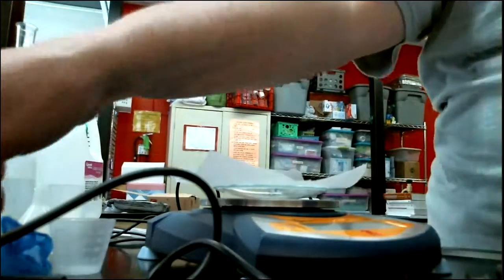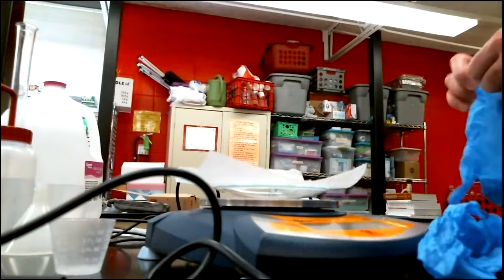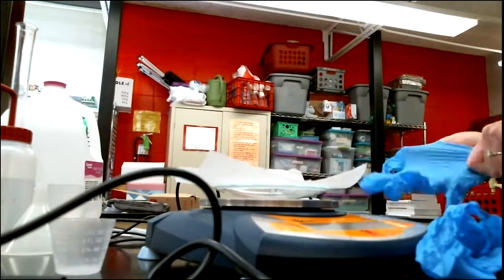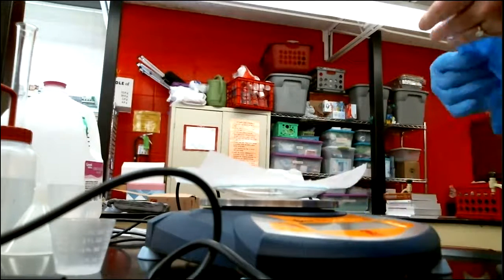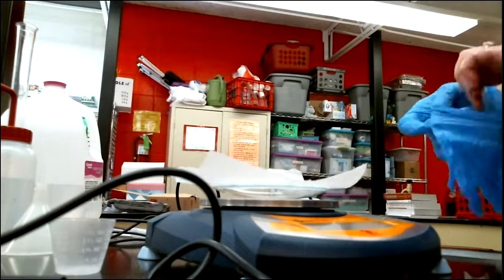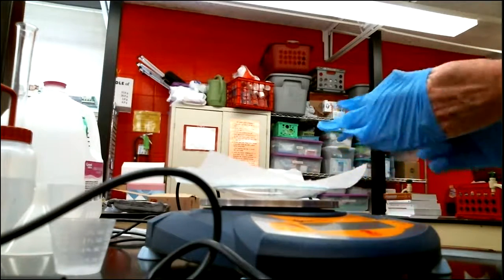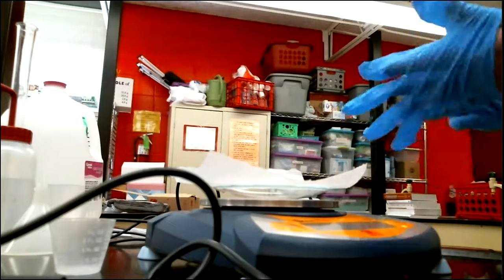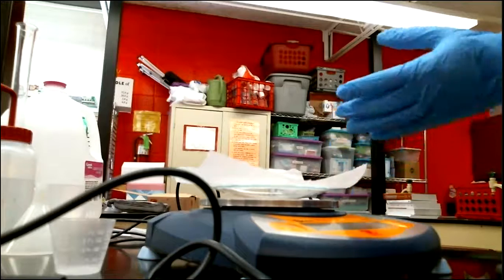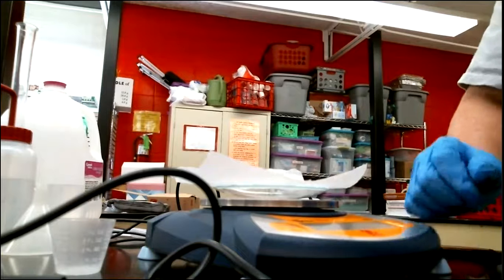Now, Epsom salt is not hazardous, but for good lab practice, I'm going to wear gloves. But in other situations, you wouldn't want to make solutions out of a strong base or an acid or something like that and not be wearing your lab equipment. It's there to protect you. So make sure you take care of yourself.